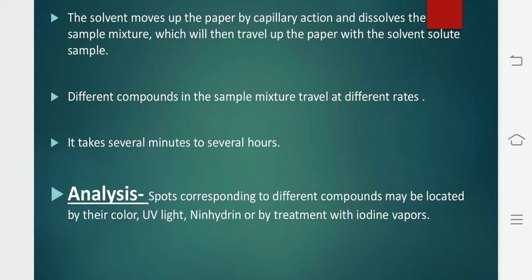Okay, as I told you, the solvent moves upward with the help of capillary action, and the sample dissolved in the mixture will travel up the paper with the help of the solvent.